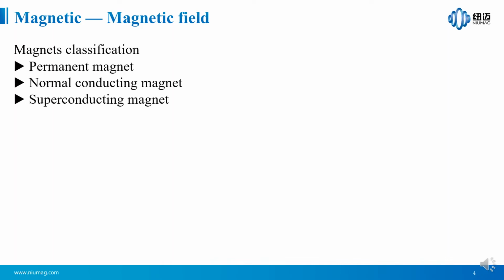Well, the second part is the magnet, which is the magnetic field. It is one of the most important components of NMR. Magnets, which provide the magnetic environment, can be classified into three categories. The first type is the permanent magnets. Permanent magnets are made of magnetic materials. The equipment involved in this course is a permanent magnetic system.